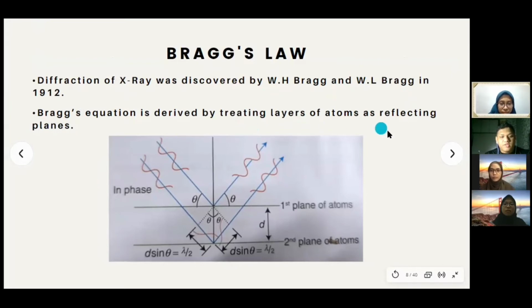When we look at the picture, if we think of scattering equivalent to electrons from two adjacent parallel planes of atoms separated by a distance, the angle of constructive interference, which produces a diffraction intensity maximum, occurs between the planes and the wavelength, and is given by the Bragg equation.